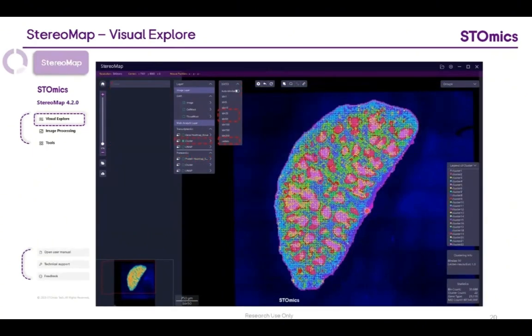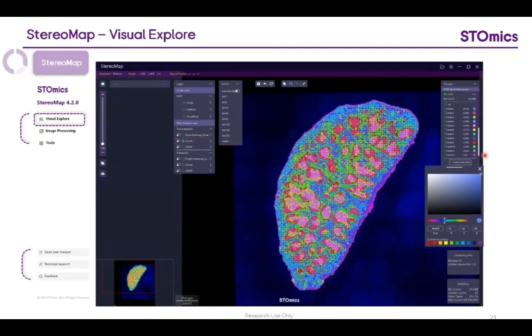For clustering results, only bin 20, bin 50, and cell bin views are available by default. If you need other bin sizes, you can generate them using the SW reanalyze pipeline. And in the right panel, you can manually annotate clusters and adjust their color for better visualization.